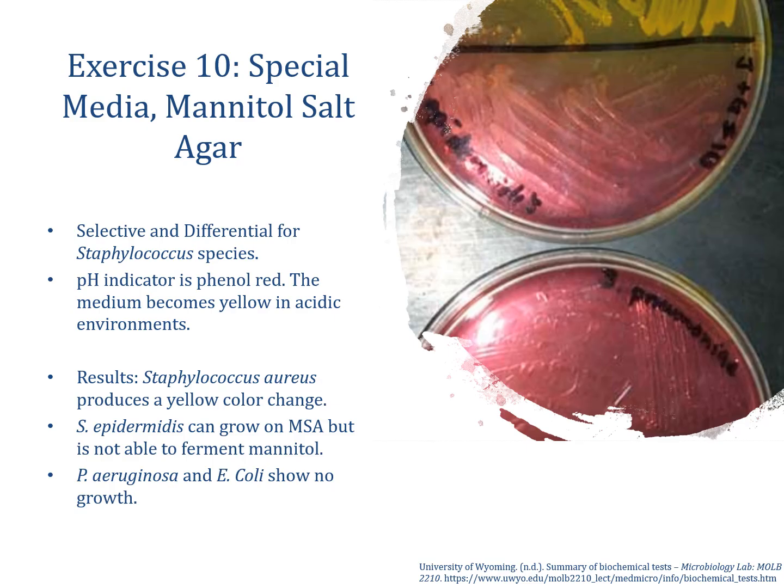Tryptic soy agar is an all-purpose media. It's supportive of all bacteria, or most bacteria that you would inoculate on that kind of agar. Mannitol salt agar is selective and differential, and eosin methylene blue agar is also selective and differential.